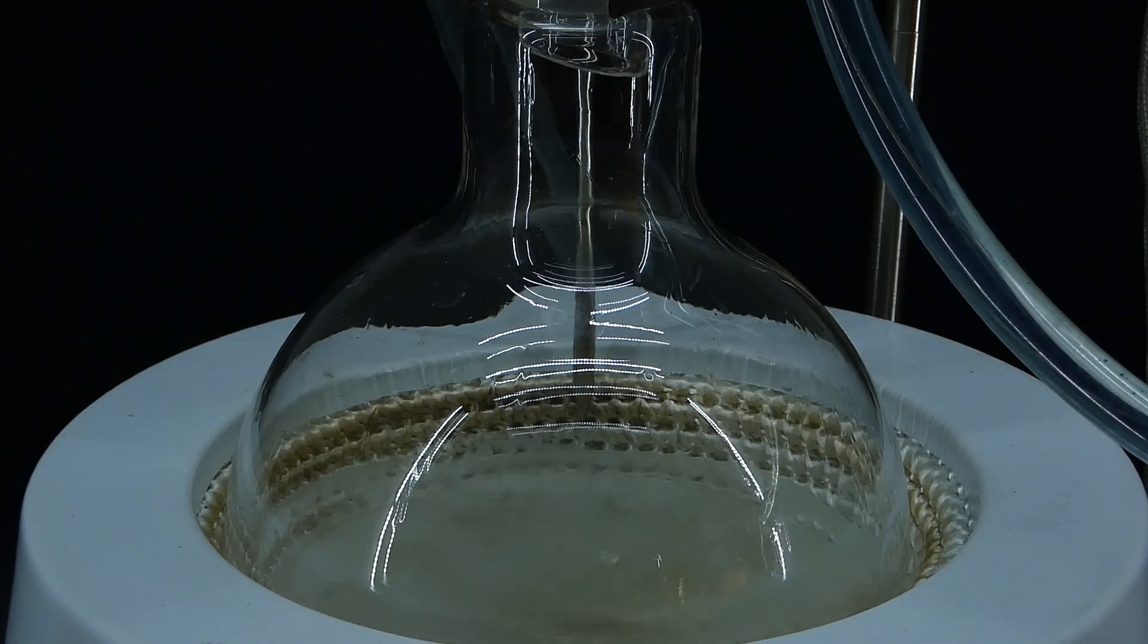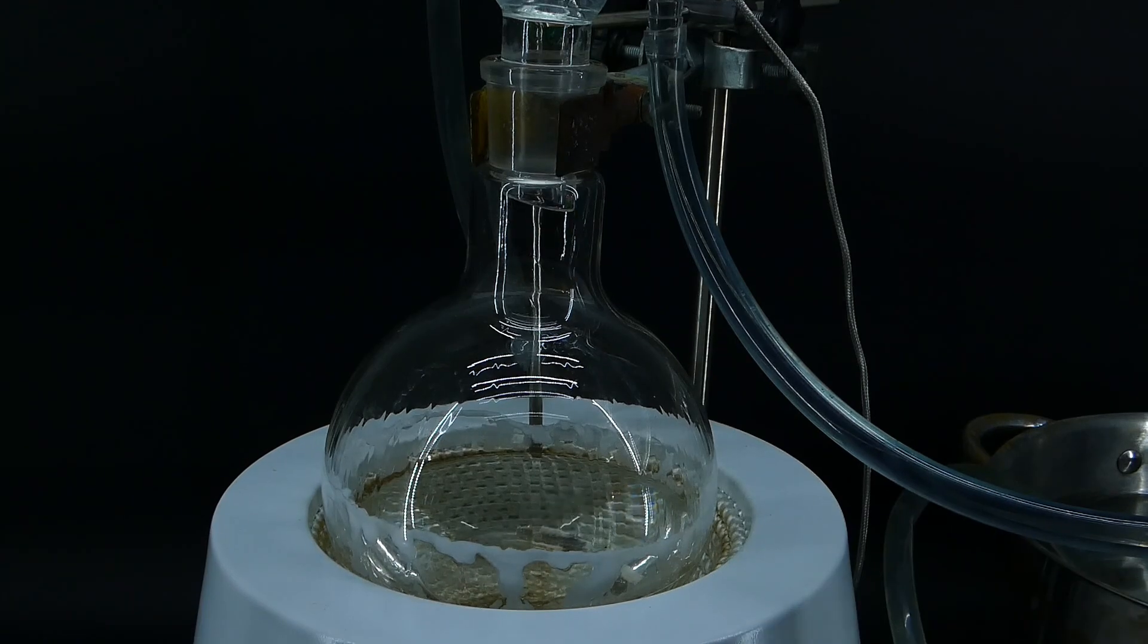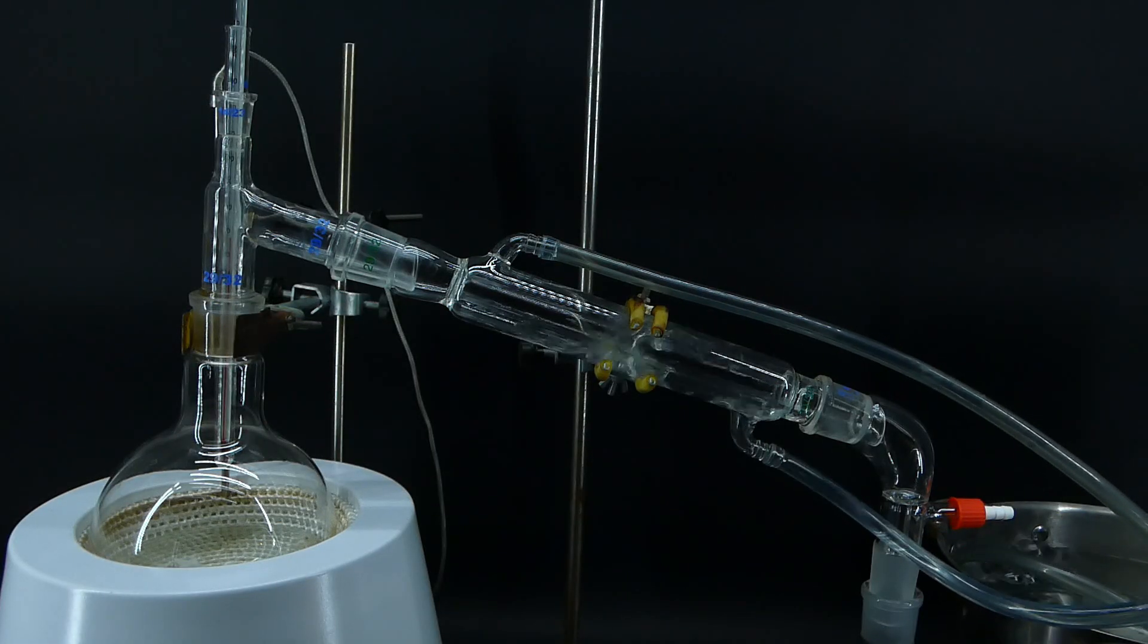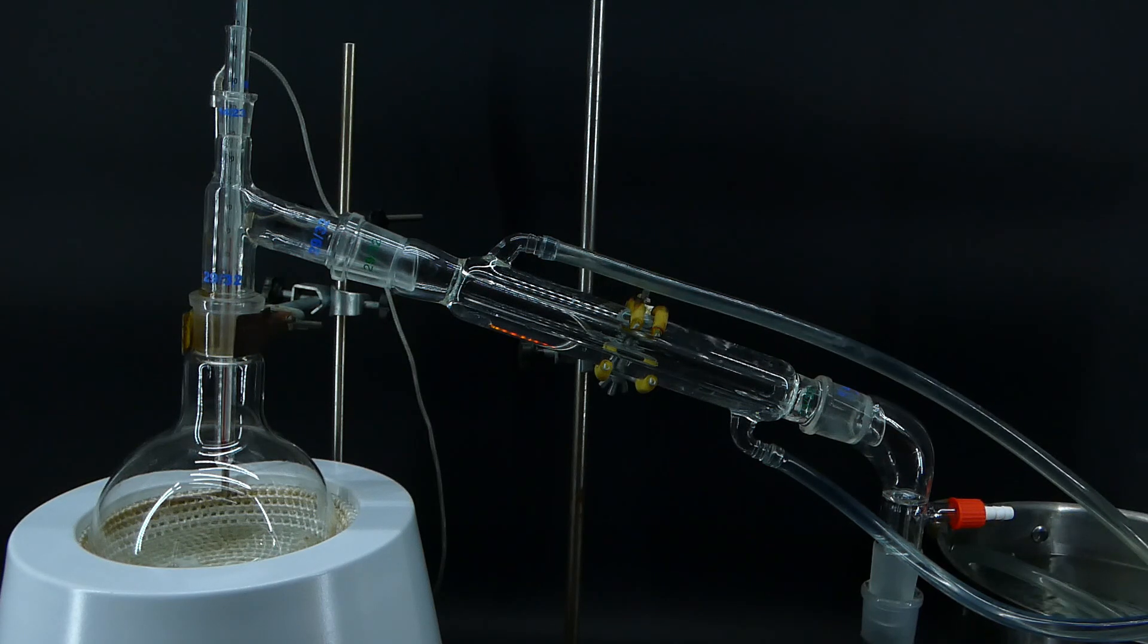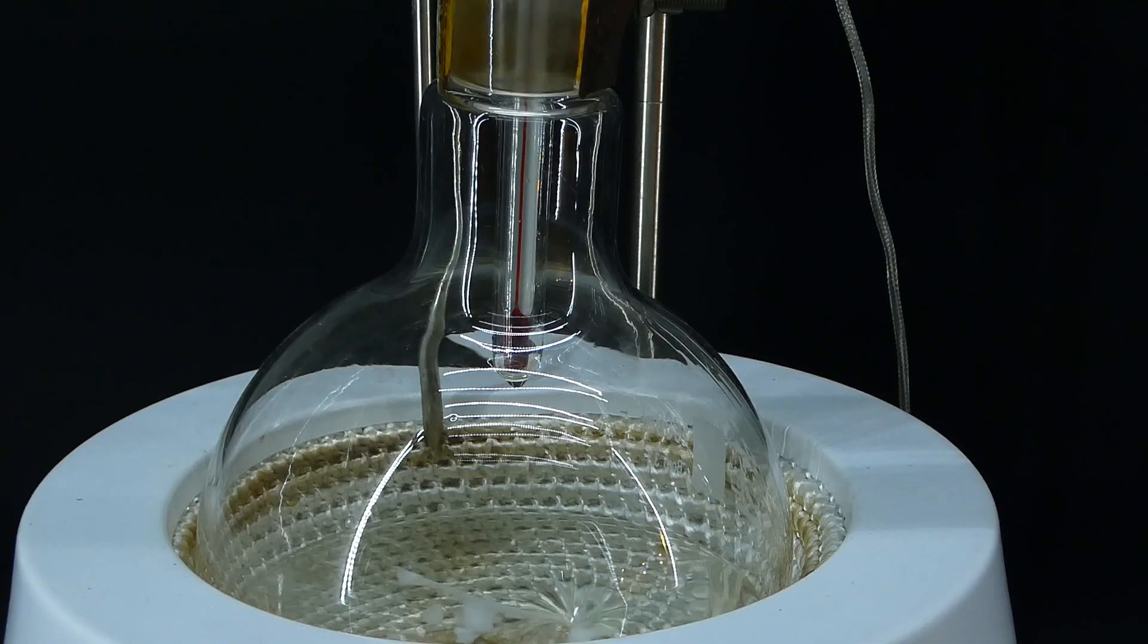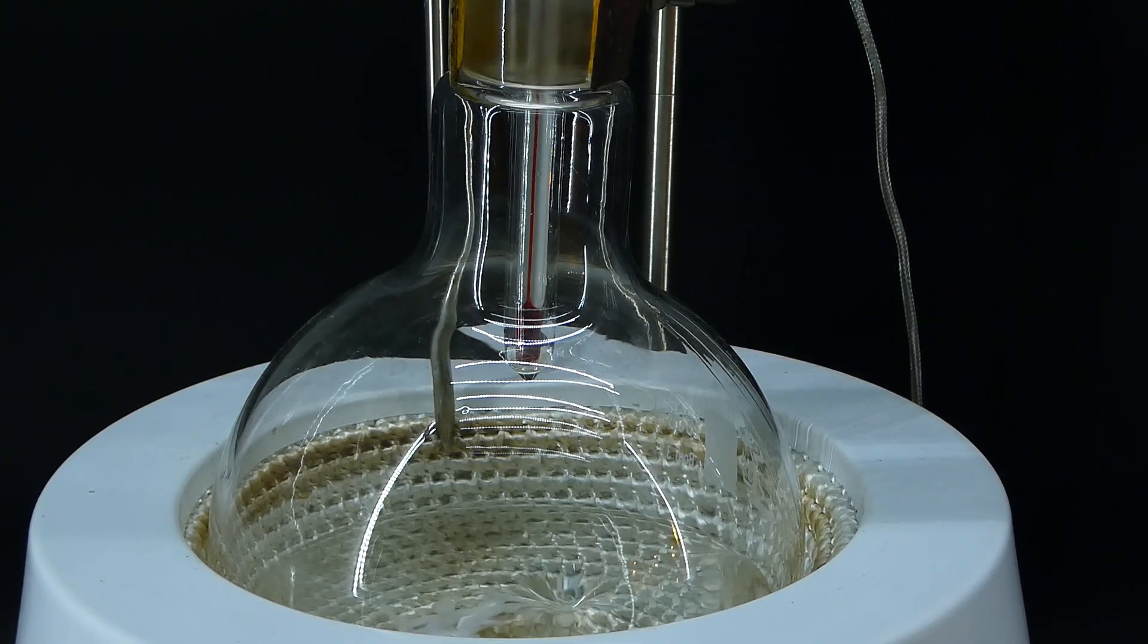After about 40 minutes of refluxing, I took the mixture off the heat, allowed it to cool, and started to assemble a simple distillation apparatus in the place of the reflux. After that was done, I turned on the heating and allowed the mixture to slowly distill.